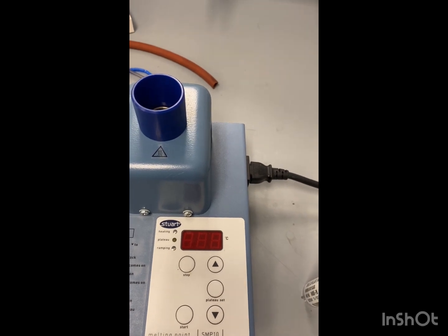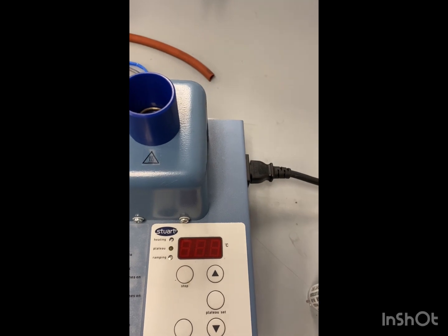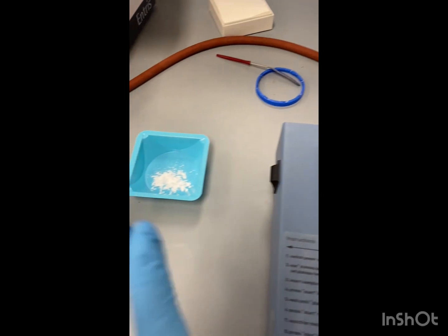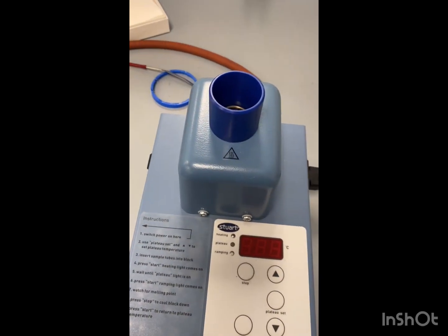So we want the range to be anywhere from 236 to 237 degrees Celsius because that's the reported range for meso-stilbene dibromide, which hopefully that is what we have performed here. So we're just going to confirm it with melting point.